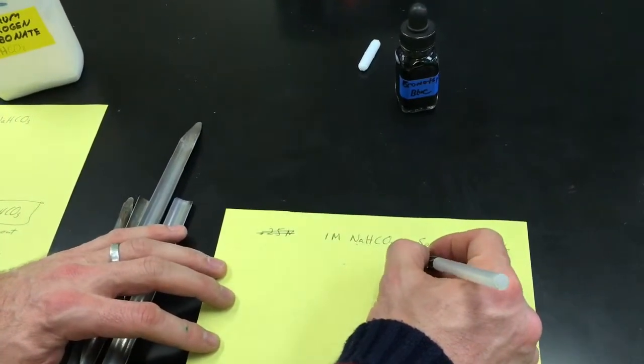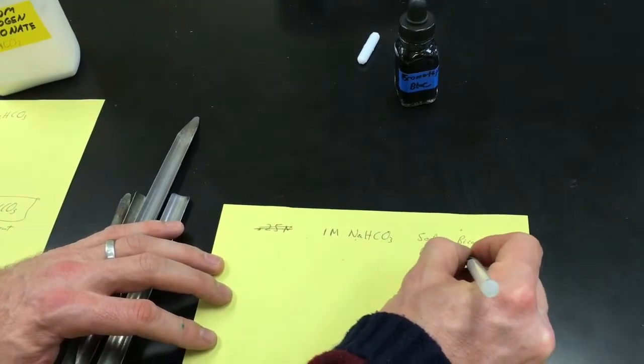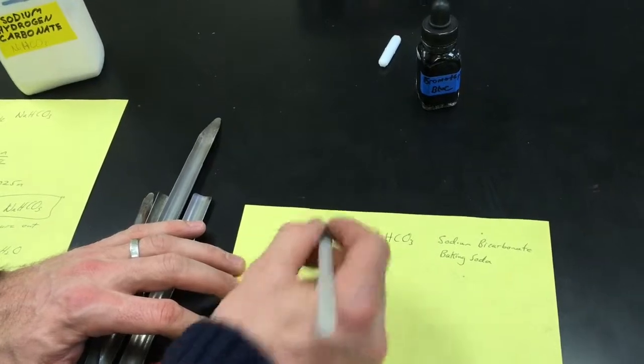Now, some of you have this in your fridge, so it eliminates odors or smells, or the common name is baking soda. And I believe your teacher wants you to make 25 milliliters of that solution. So how do you go about doing that?